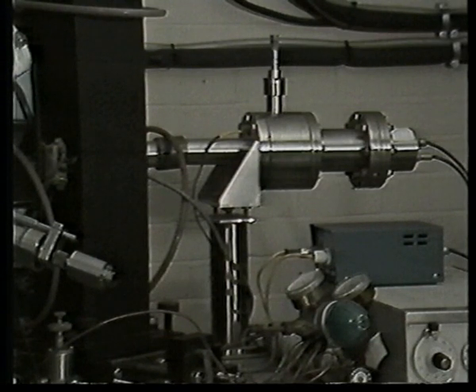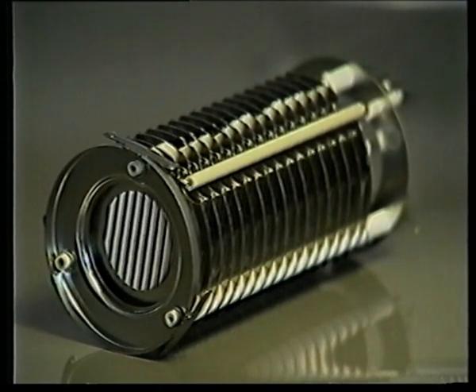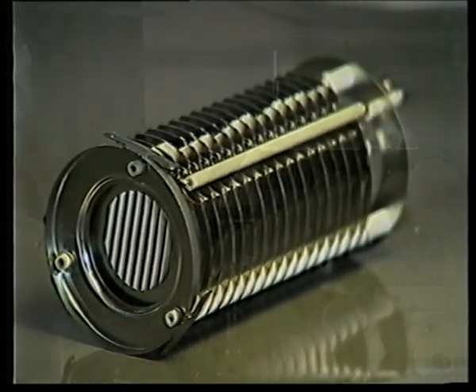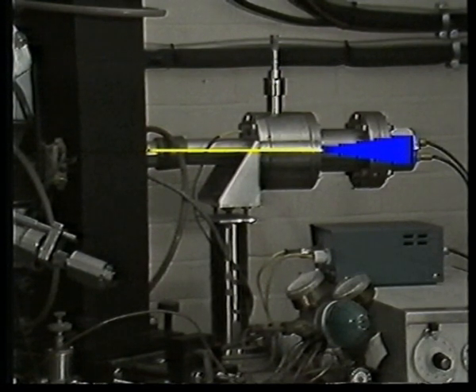The detector, in this case, is an electron multiplier. Here it is, removed from the mass spectrometer tube. It contains a number of thin metal electrodes known as dynodes. If you count them, you'll find that there are 17 in this case. The small numbers of ions hitting the first dynode at the front end of the detector eject secondary electrons. Each of these electrons ejects many further secondary electrons at the next dynode. Hence, an ever-increasing number of electrons are ejected at each of the 17 dynodes. The resulting avalanche of electrons, shown here in blue, amplifies the signal by a factor of about a million before it's passed on to the display unit.